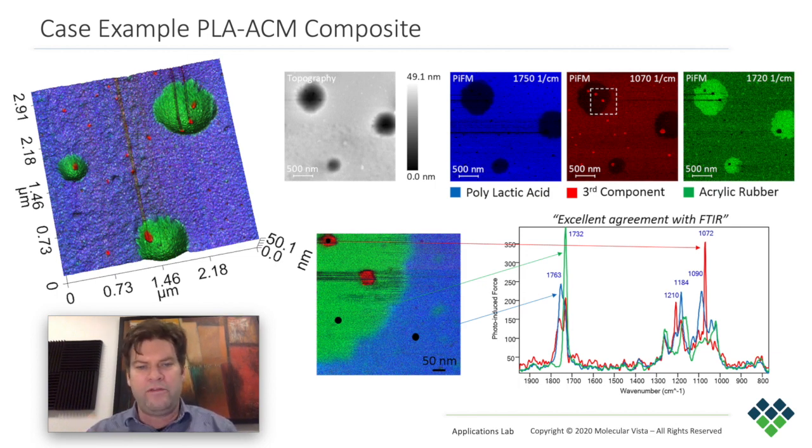And we can zoom into those, we can take a point spectrum at those locations, and as you can see, we get a completely different spectral response, highlighting that there is something different in the chemistry of that location.